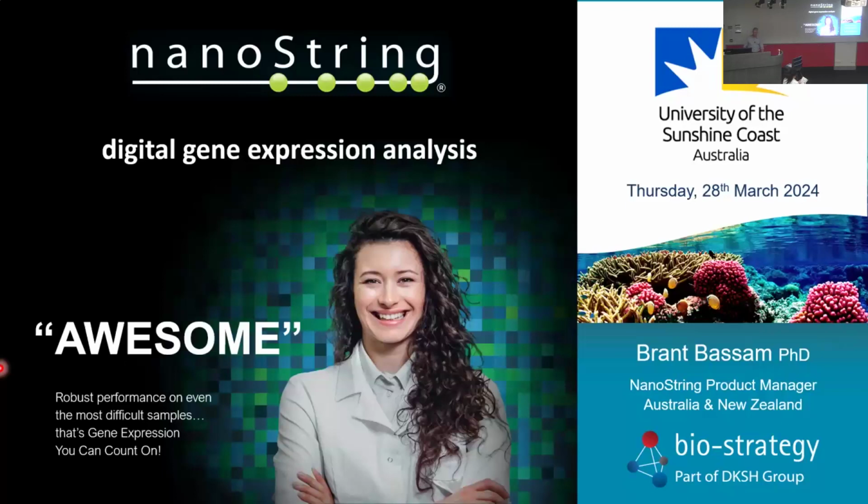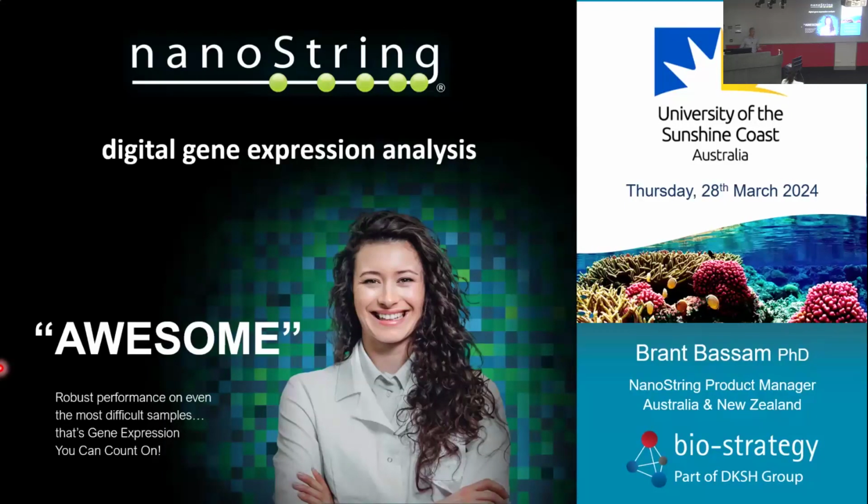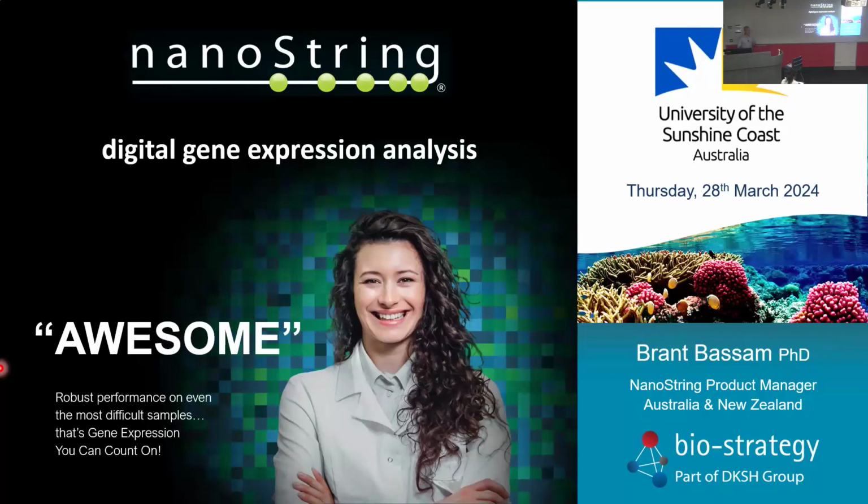Anyway, I'm here to talk to you today about a technology called nanoString. Anyone here familiar with nanoString? Used it at all? Few? Great. Anyone doing gene expression studies? Anyone not doing gene expression studies? Sorry, a few that are not? Okay. Well, this technology is really focused on gene expression, or what you might do with reverse transcription PCR, RT-qPCR. But it's generally very interesting.